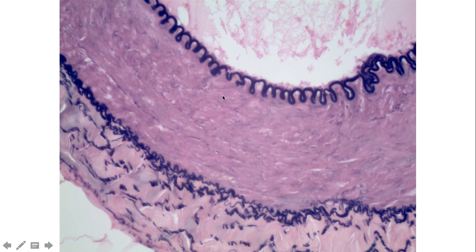And then we can see here this very thick tunica media. This is that smooth muscle layer. There's going to be a little bit of elastic tissue in here, but nothing like we see here at the inside or the outside of this layer. And so outside the tunica media is then going to be this external elastic lamina, this external layer of elastic fibers. And outside that, we can see a very nice tunica externa, and this is that connective tissue layer.